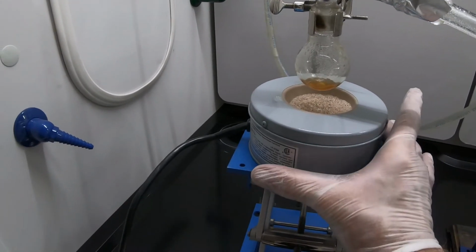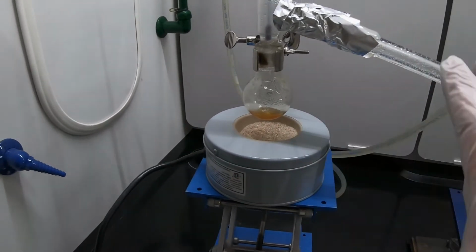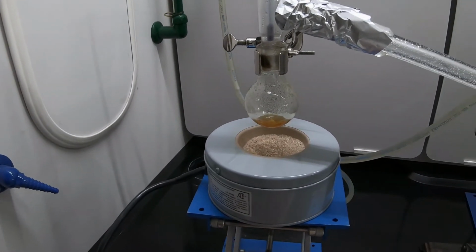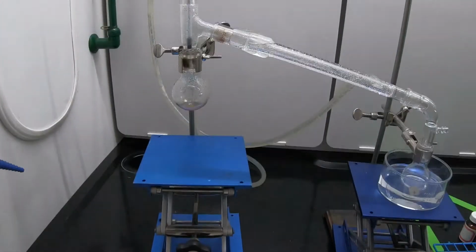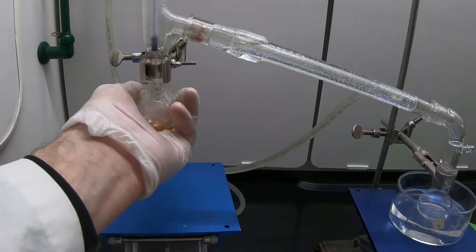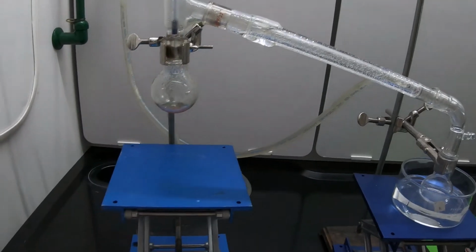All right. This is quite warm. I'm going to leave it sit. Because we do still have some vapors present, I'm going to let this cool for a little bit longer away from the heat source before I turn off the condensing hose. All right, we've let the system cool for approximately 5 minutes. I've removed the heat source. The flask is very comfortable to touch. Well, it's warm. It's not hot by any stretch.